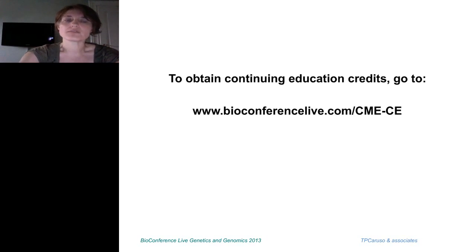So check with your provider, or if you have your own instrument, then I would go through and make sure that you have all of the reagents, and that all the specs are up to scratch. So you create your own rules and make sure that it's just the same as with your Sanger sequencer. Just follow similar rules. I'm pretty sure I'm not off the mark here. But I would check with one of the providers, and if you want to, I would have to look for who that lab is.